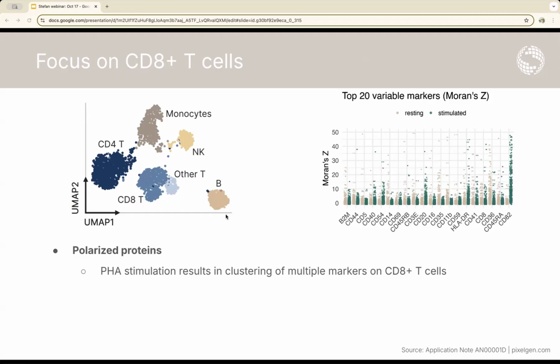So since the focus here is going to be on visualization, we're going to skip a significant portion of the analysis, and we're looking at an already annotated data set. All of the prerequisites, the pre-processing and annotation, we're going to disregard for the time being, and we're going to focus particularly on the CD8 T cell subset from PBMCs. And basically, the analysis would traditionally start with doing a differential comparison between the conditions within our experiment, here being activated and resting T cells.